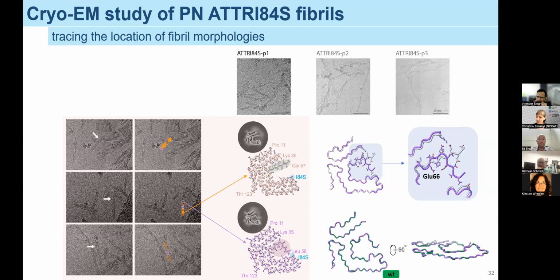So are these generated by the proteasome and the degradation pathway, and they just build up and start forming fibers after they've been cleaved? I'll say there's still not 100% evidence of when the proteolytic cleavage is happening. But definitely when you see these fibrils, they have classes where few of the classes have full length TTR.